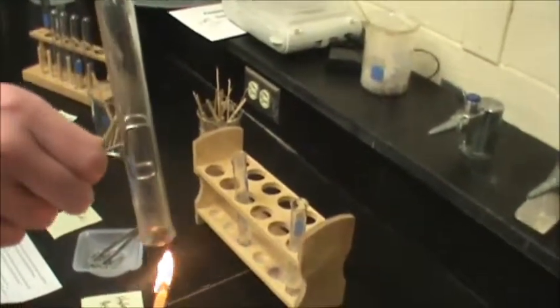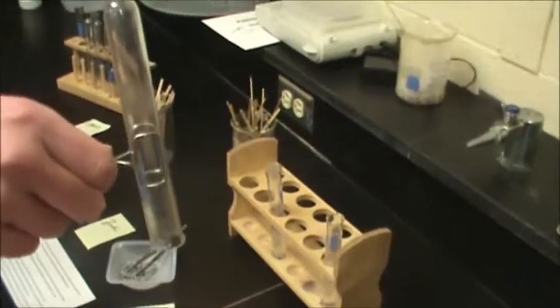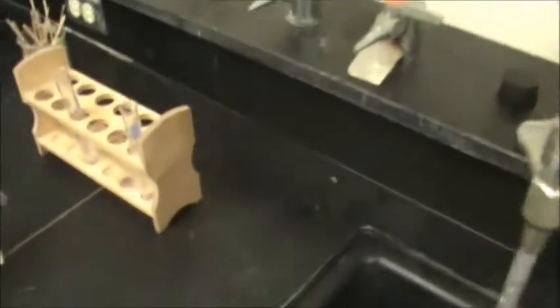You move it, because I can't see. Oh, we had a nice pop right there. It was nice and explosive gas. I'm going to blow out my flame. Go ahead and put it down. As you can see, the reaction's still going on.